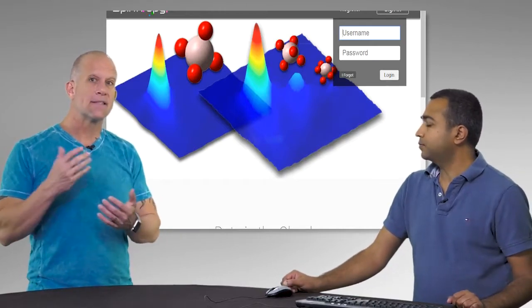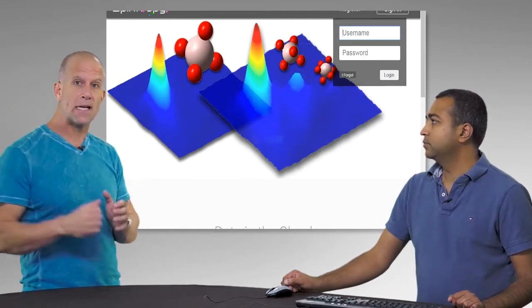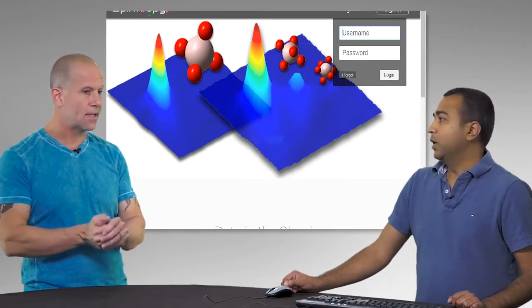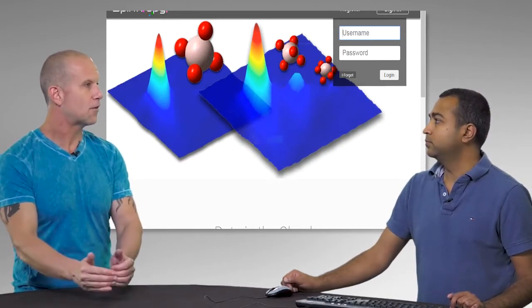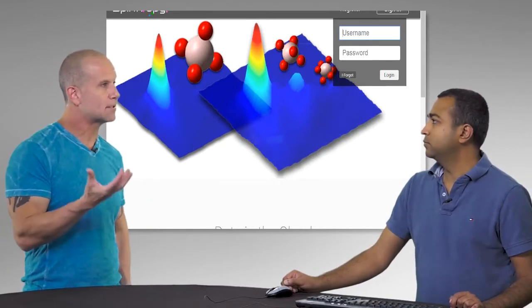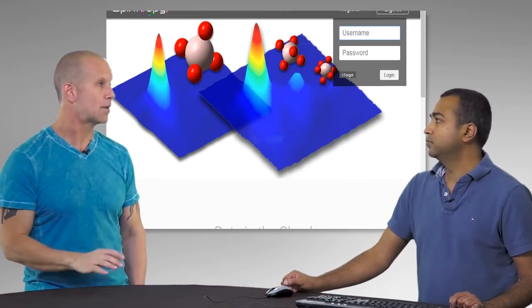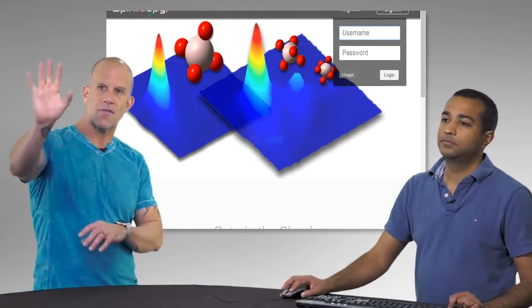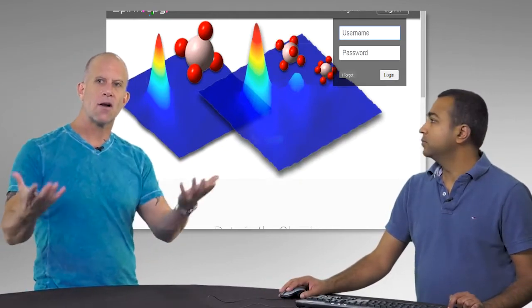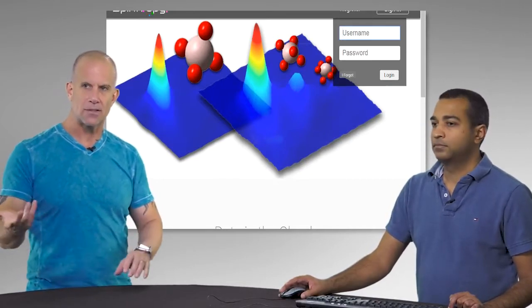As we've seen, the part we just showed on IconNMR assumes you already have a Spintropy account. You would say that's the first step even before submitting your first sample, because you need that Spintropy username so that the data gets routed correctly onto the cloud. So they've already registered here, they've already gone down to the Magnetic Resonance Center, and now they have a username and password.